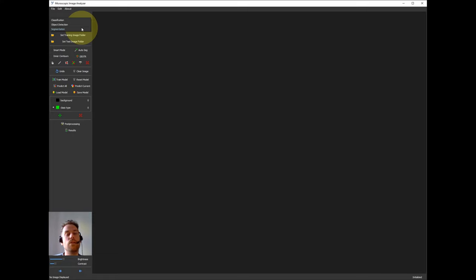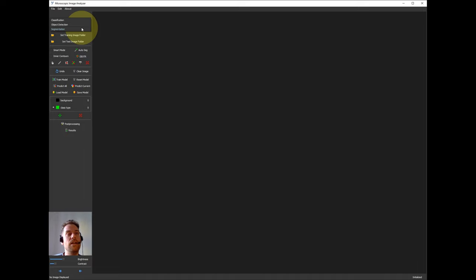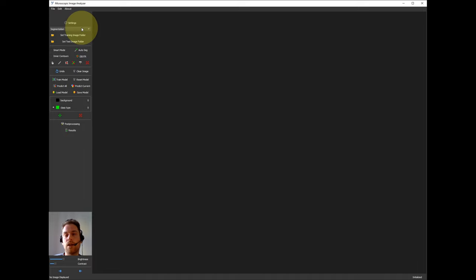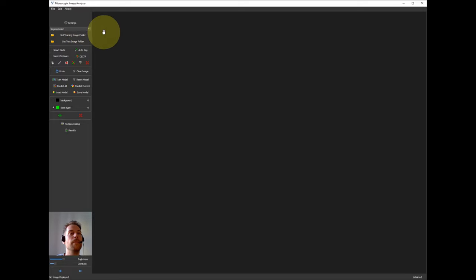Or, and this is what I'm showing today, segmentation. Segmentation is that each pixel in an image is assigned to a certain class value.